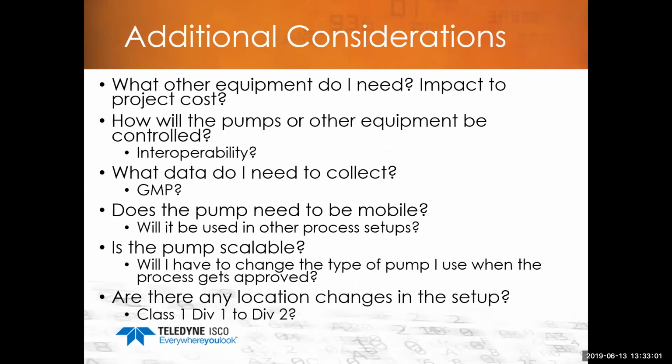How are they going to be controlled? Is there interoperability in my back-end system? A big term nowadays is GMP. Does the pump or the process need to be mobile? Do you need to be able to build it onto a rolling stand or a table? That's a very interesting application, where you can move it from lab to lab, room to room.